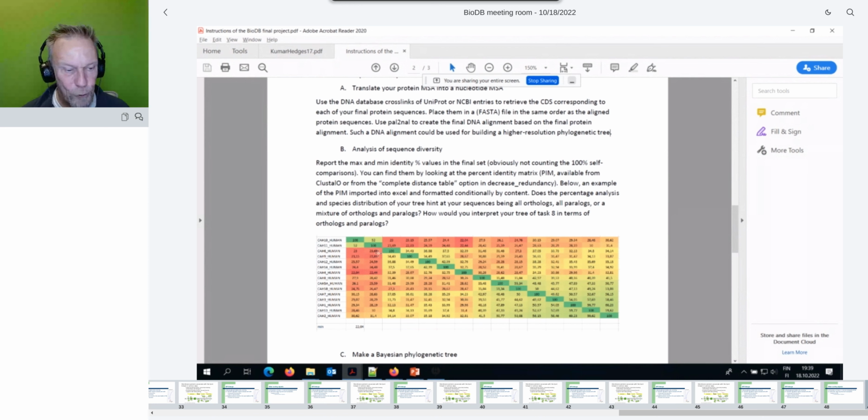Then we have 2 sequences here which are quite far from anything, so they are mainly red. And then we seem to have a group of 4 sequences here which are in the shades of yellow, and then there are other 3 which are not very clearly related to each other, but they are not closely related to the group of 4 and not closely related to the group of 5 here.